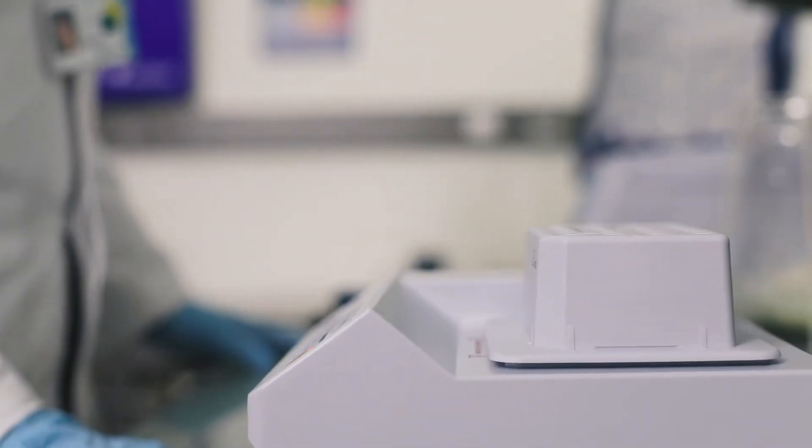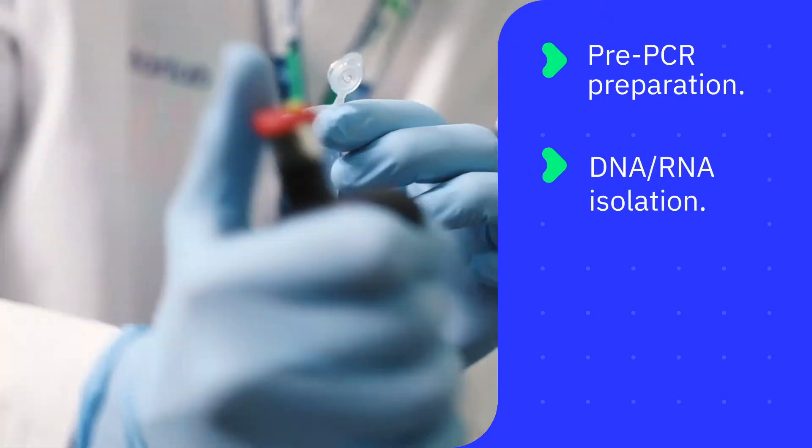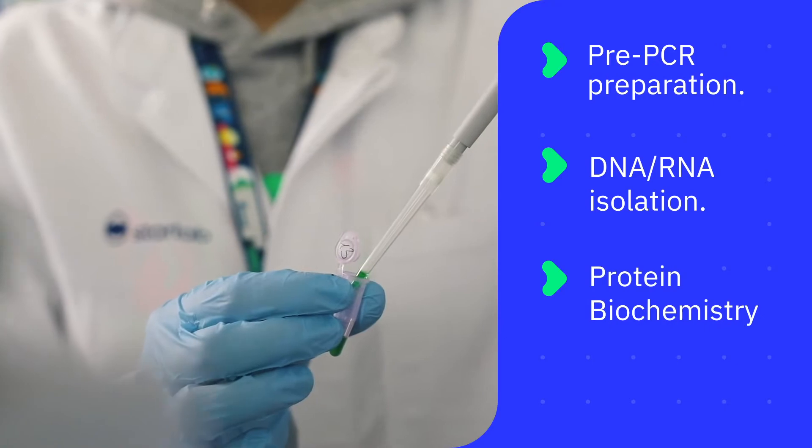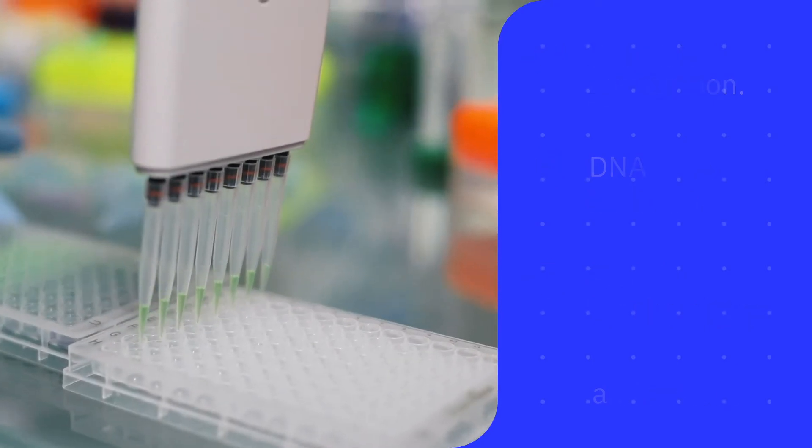This unit can be used for many purposes, such as pre-PCR preparation, DNA and RNA isolation, protein biochemistry, sample purification and denaturation, restriction digestion, and more.